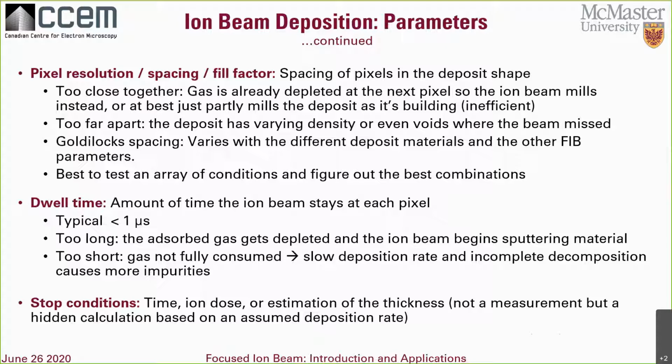You need sort of a pre-tilt stage in order to do that. But in doing that, you short circuit the whole deposition and lift out and attachment stuff. It's just milling, trenching, and thinning. So that's ideal. But yeah, I don't think I've heard of any system where the manipulator is cold.